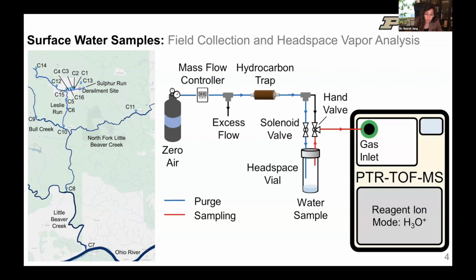We used high performance vials and septa, so we want to make sure there's no other contamination that can come through the method into an already contaminated water sample. It's very important to do this work carefully. We then placed the headspace sample in the lab for about 1 hour to reach ambient temperature.